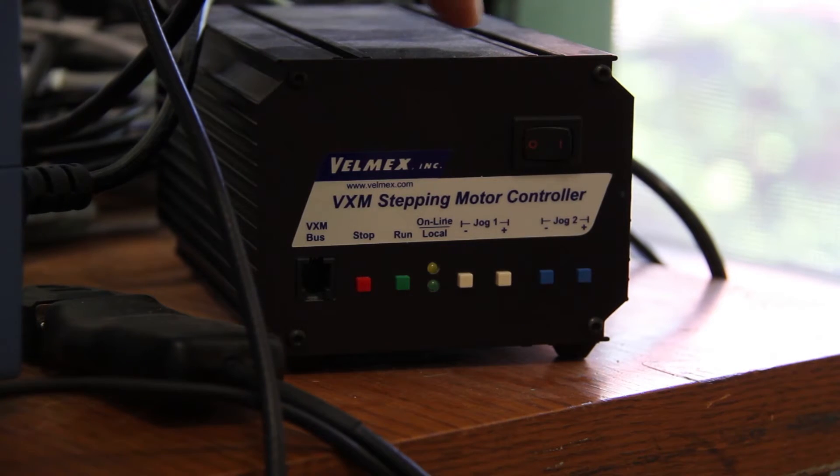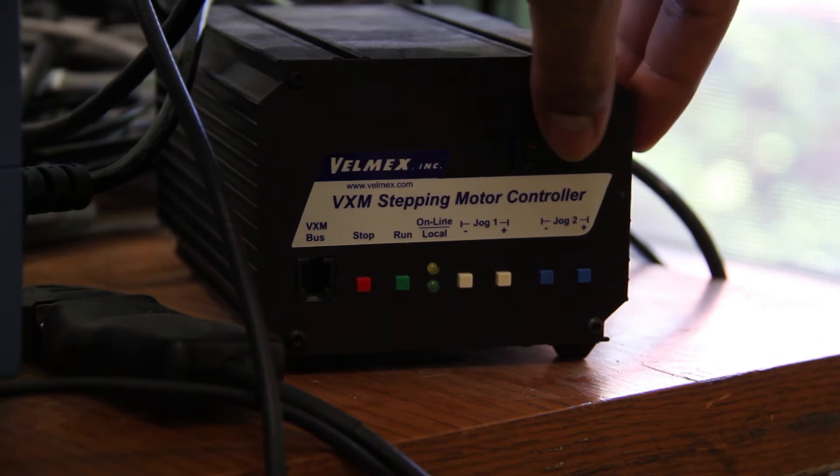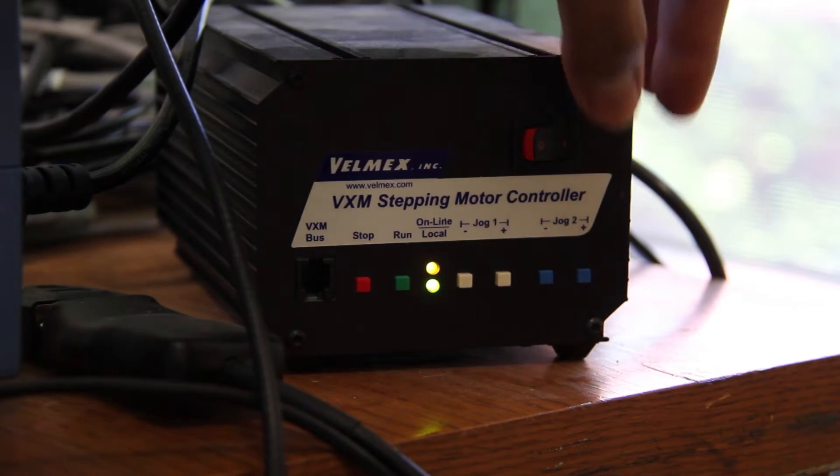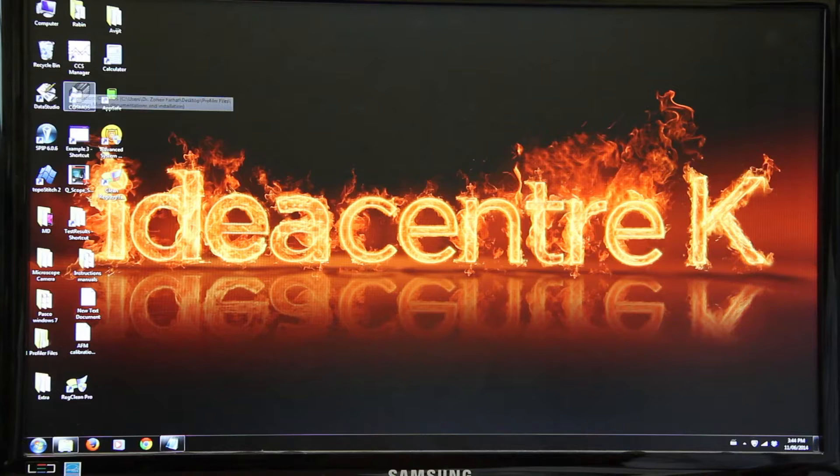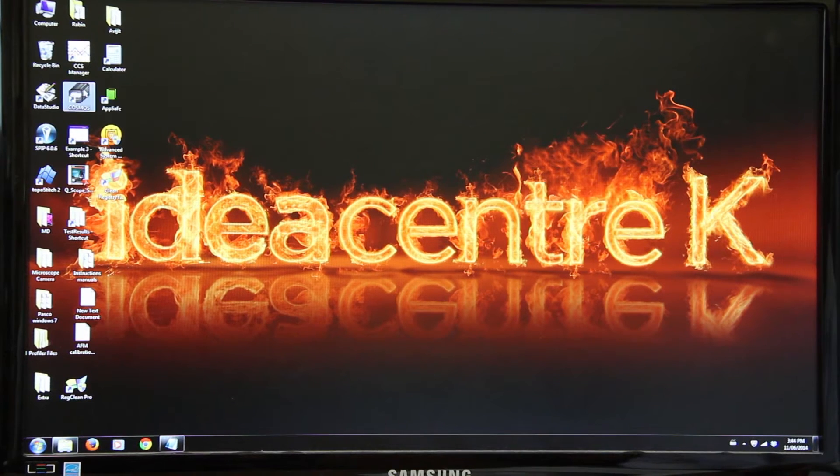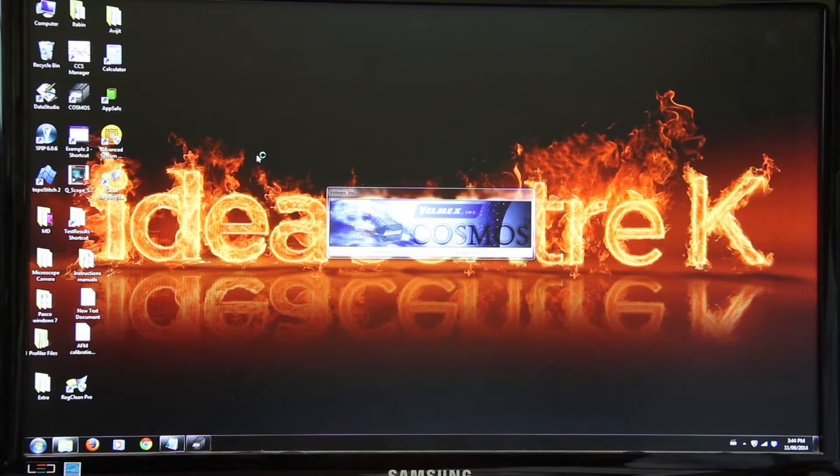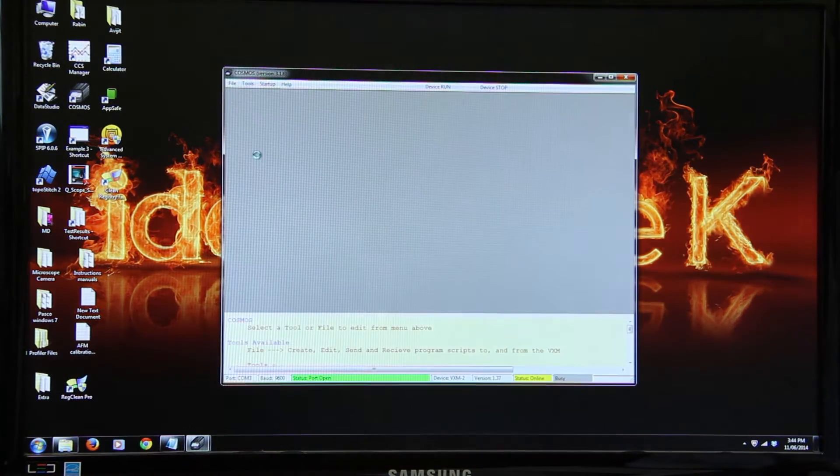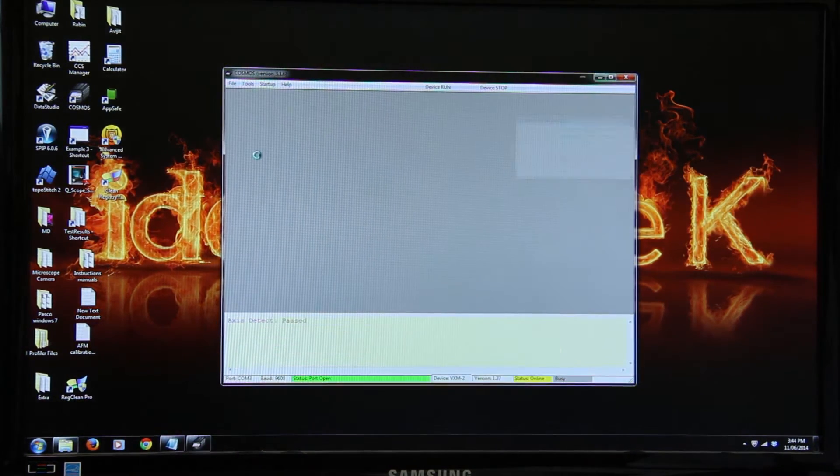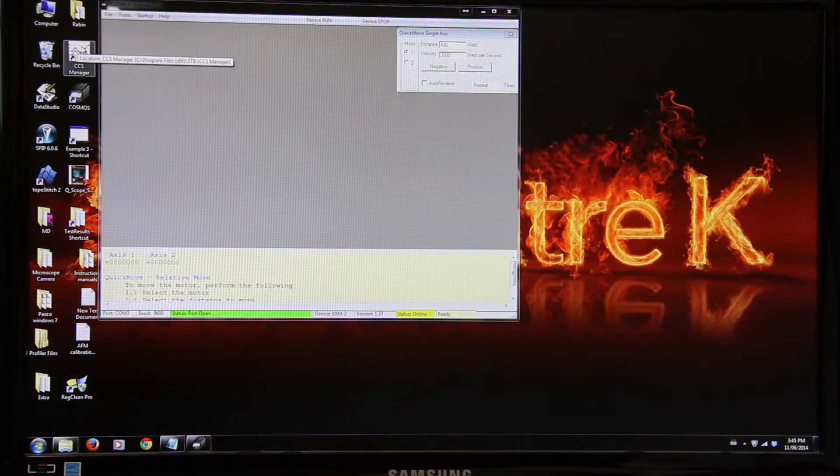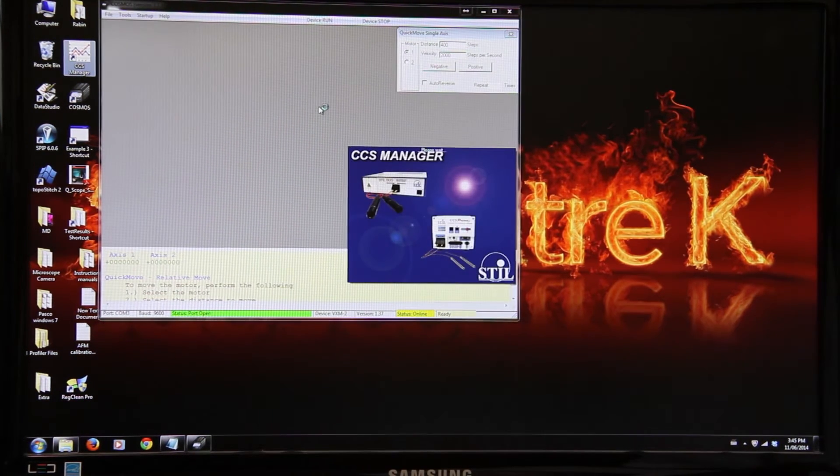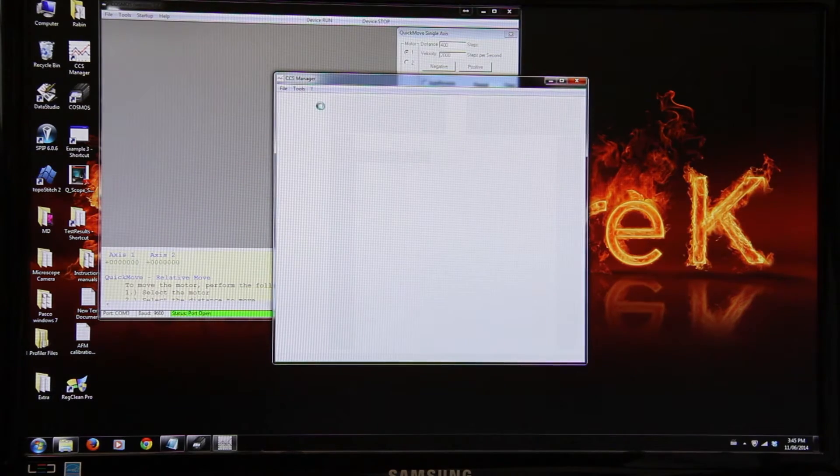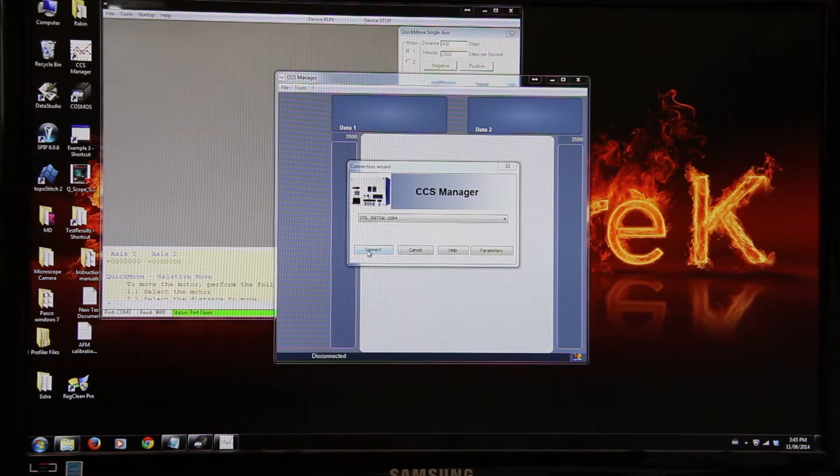This is the Velmex stepping motor controller. Turn on the Velmex stepping motor controller. Turn on the still initial sensor. Open Cosmos from desktop. Open CCS manager from desktop. Click connect.